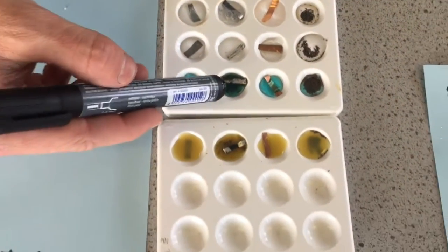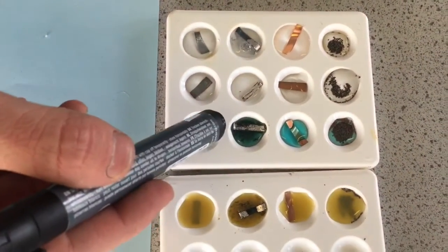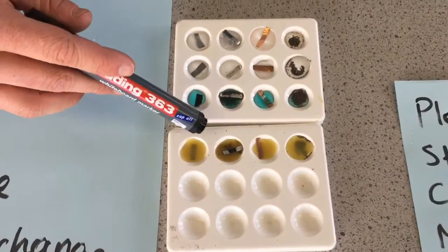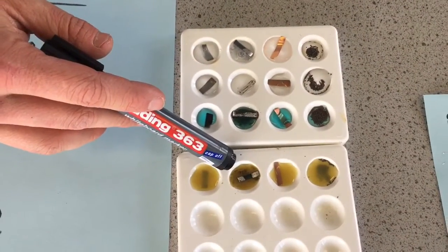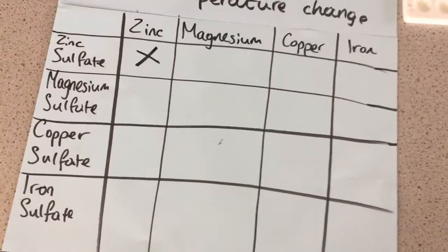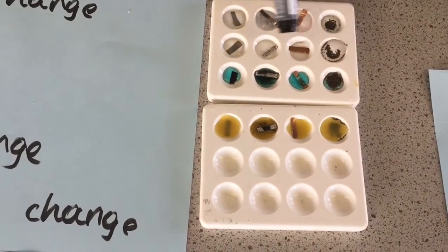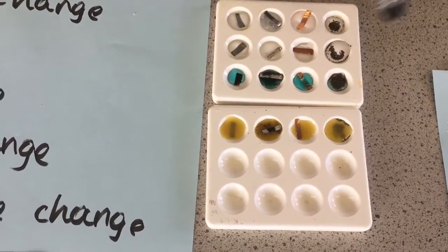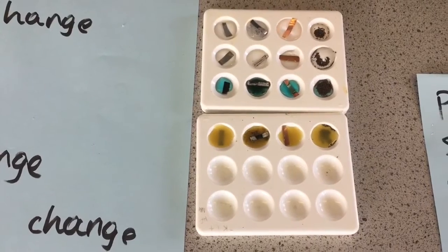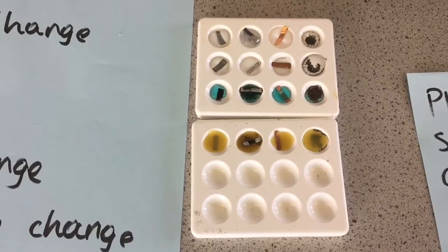We can notice here that beautiful blue solution we had before. We've got some black powder at the bottom. We know something must be happening. We've got some black powder in my iron sulfate. So it's beginning to form a reaction in there. No surprise, however, that nothing has happened in the magnesium row, okay? None of these are in the top league of that reactivity like magnesium, so they're not going to steal magnesium's sulfate.